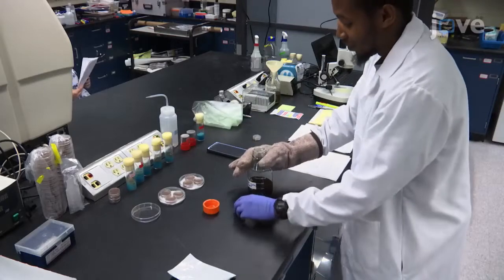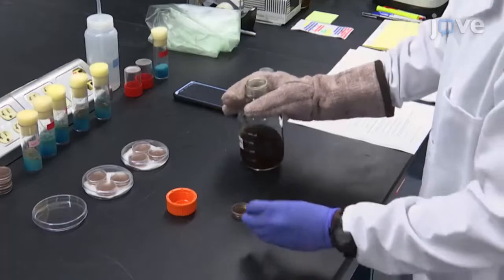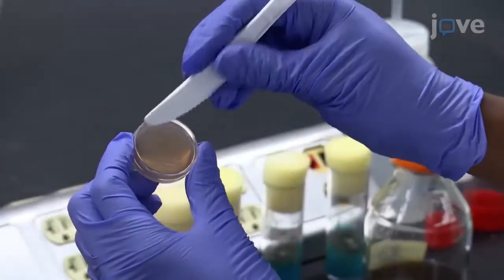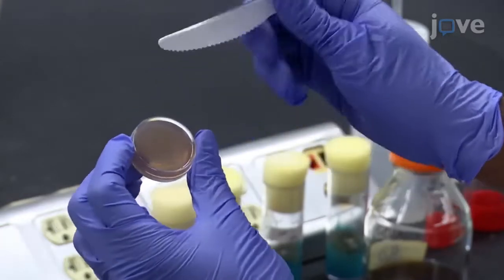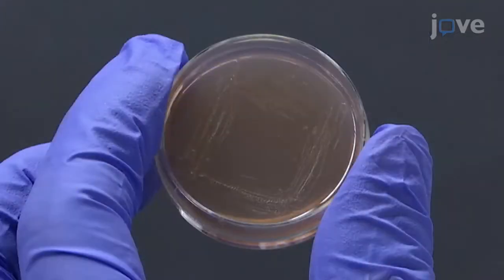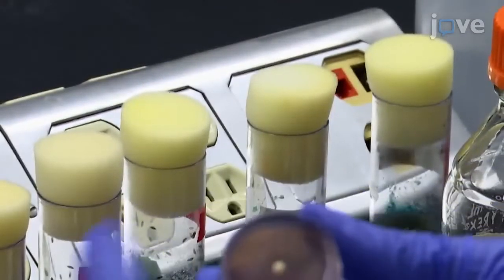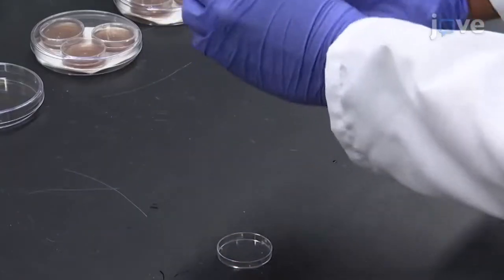Before beginning the procedure, pour grape agar into a 35mm petri dish to half full and allow the agar to solidify for one hour. When the agar has solidified, use a small plastic knife to gently scratch the surface of the agar around the outside of the plate, leaving the middle of the plate free of scratches. Then place a small amount of freshly prepared yeast paste into the center of the dish and place the dish into an embryo collection mini-cage.